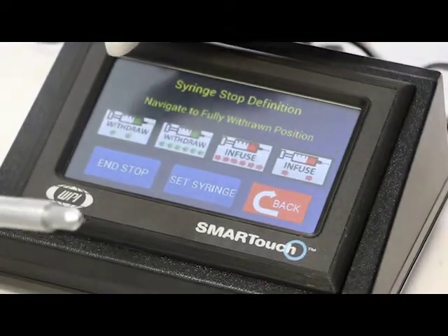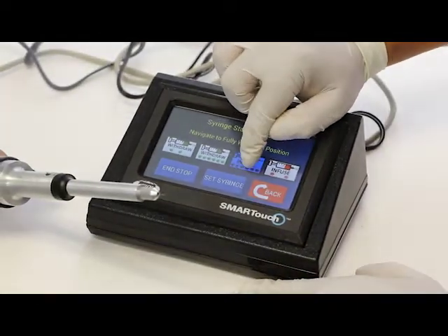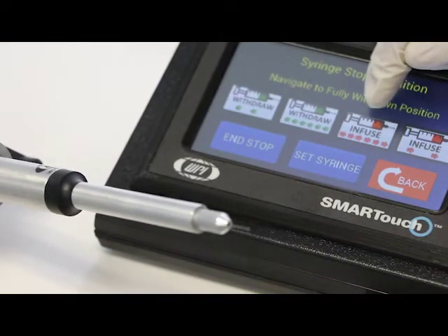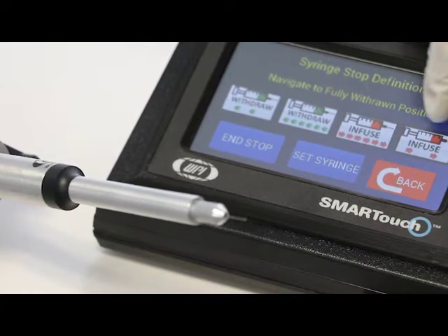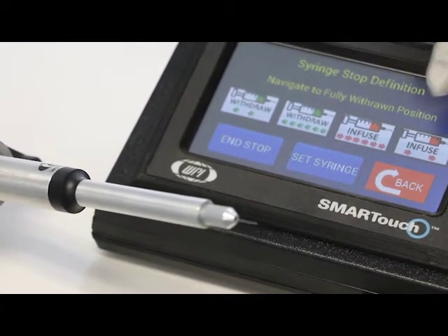What you should do is infuse to bring the plunger out a little bit outside the collar. You have two speeds when you are doing this. You have the high speed with the many arrows. And then you have a slower speed on both withdraw and for infuse.